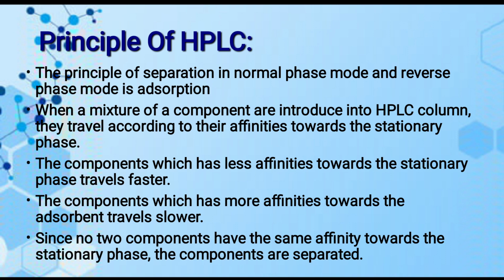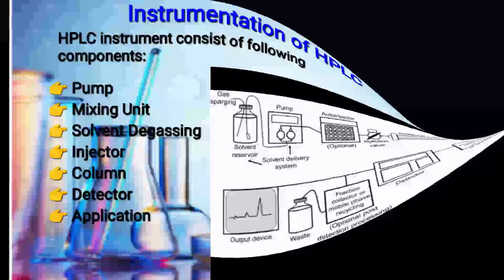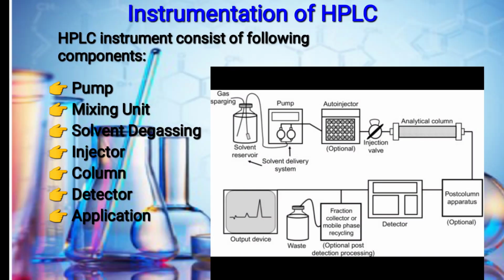So in HPLC we are using a specific type of solvent, and that solvent is filtered, and it is known as HPLC grade solvent. So in HPLC solvent, any type of particles are absent.